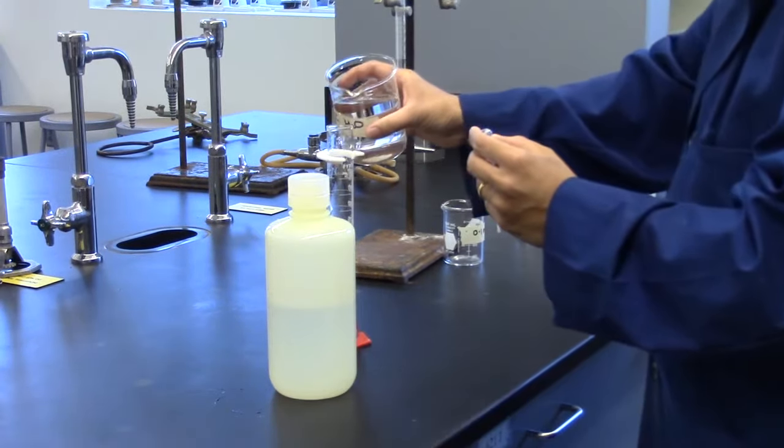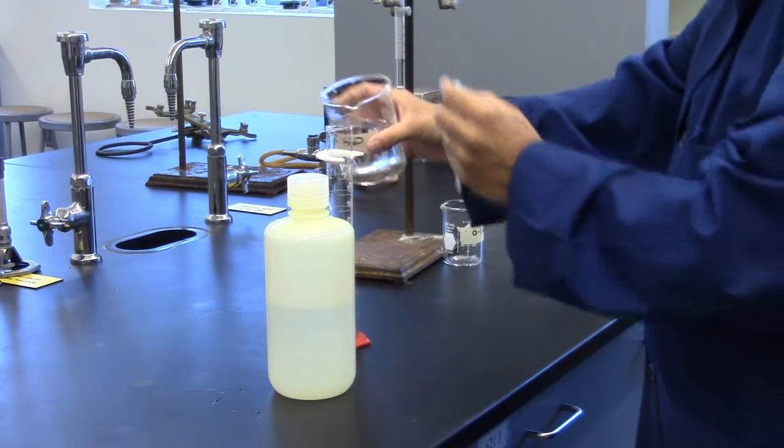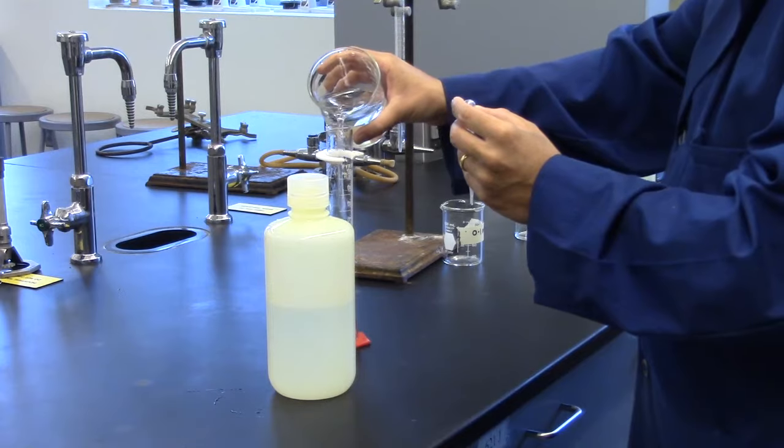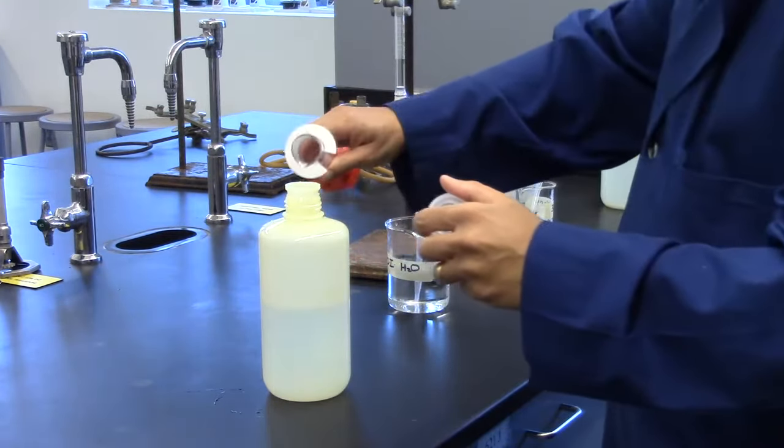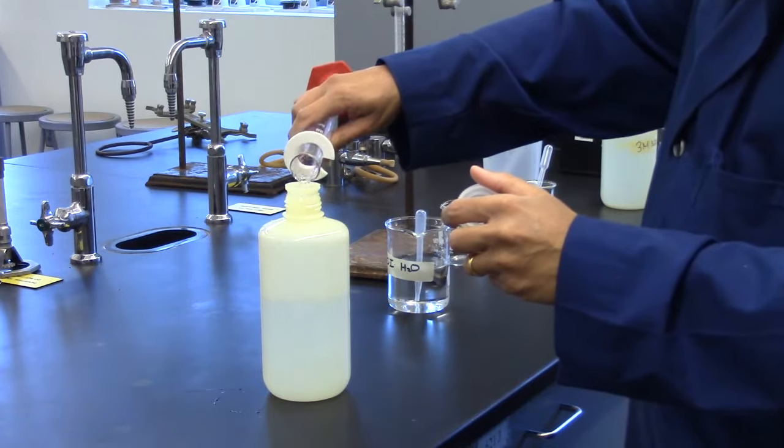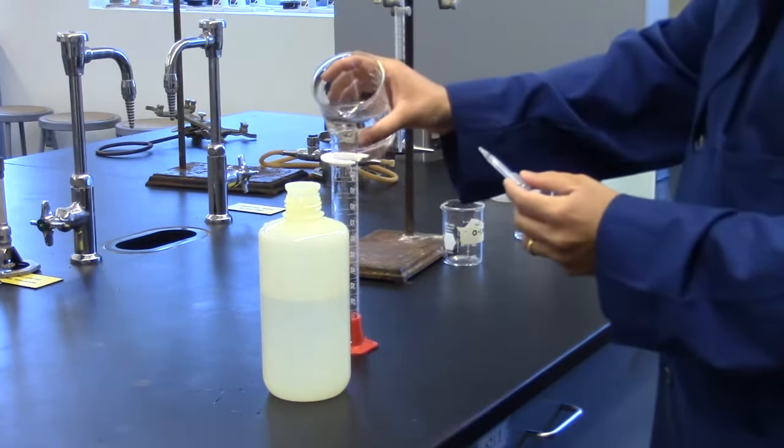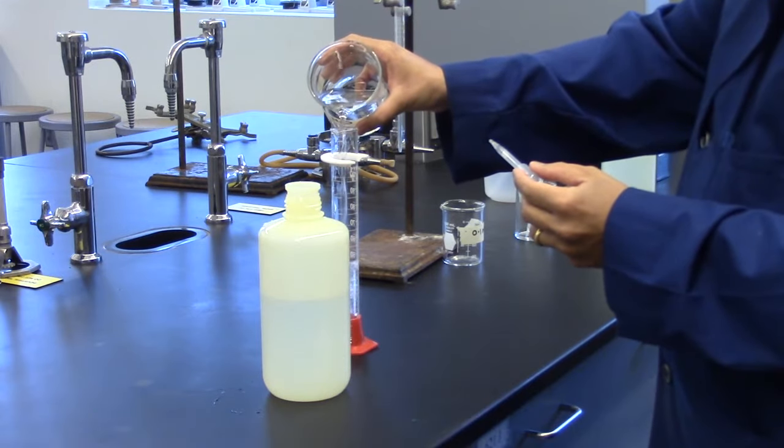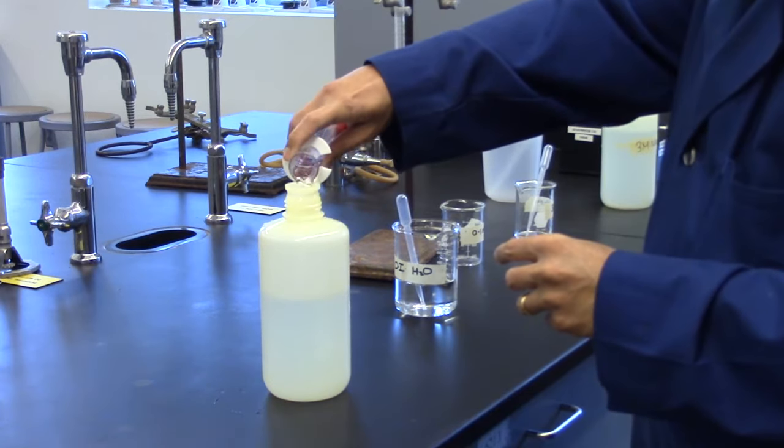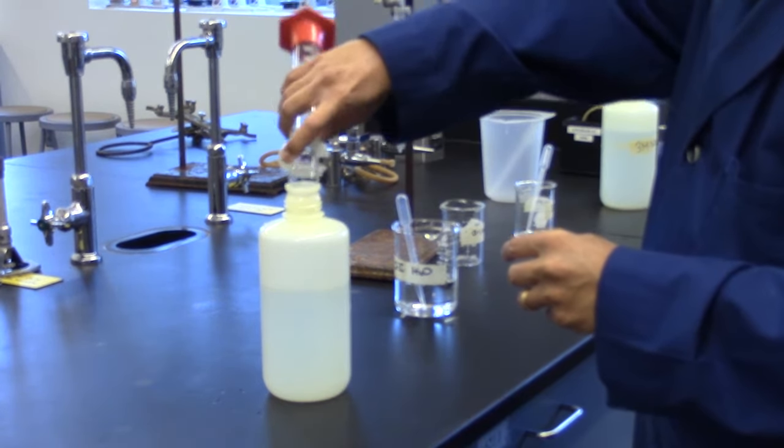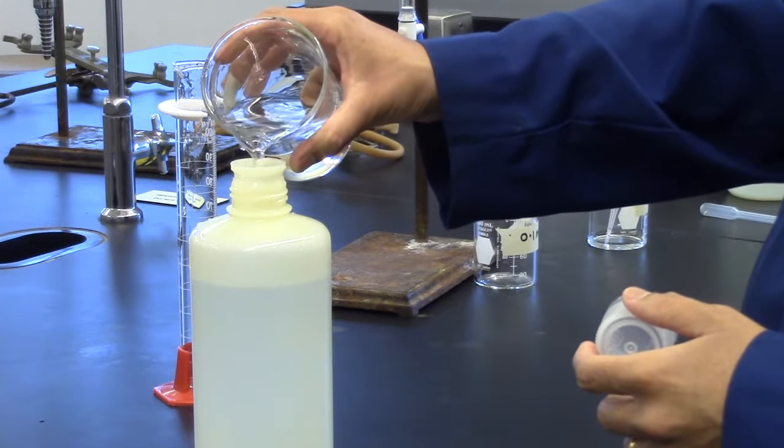Next, fill graduated cylinder with distilled water and pour into the 1 liter bottle and repeat twice. Now, add enough distilled water to fill to the top.